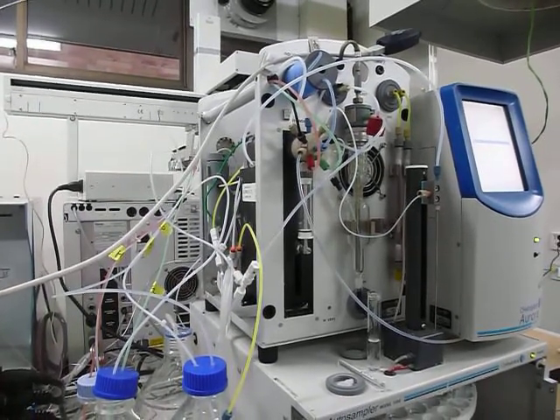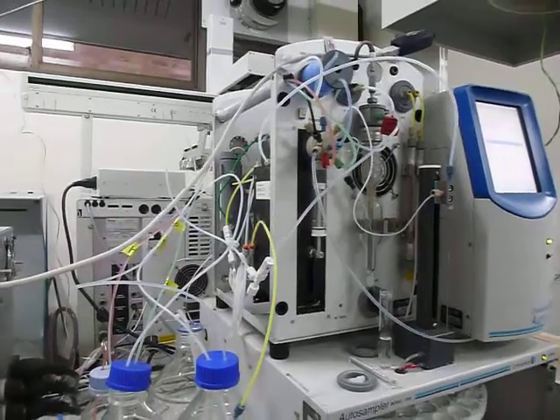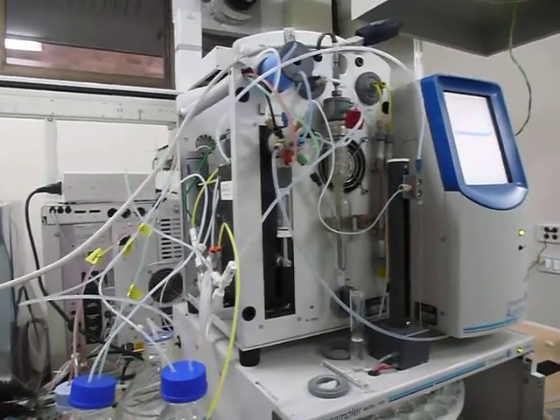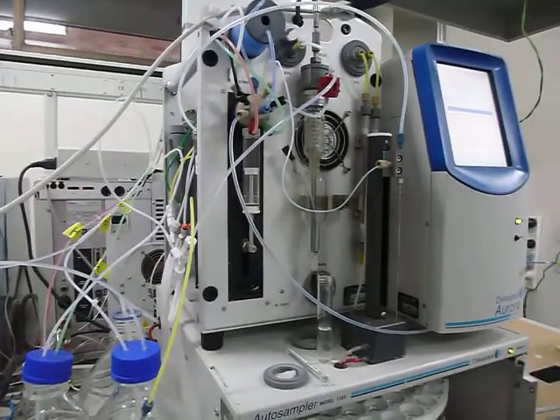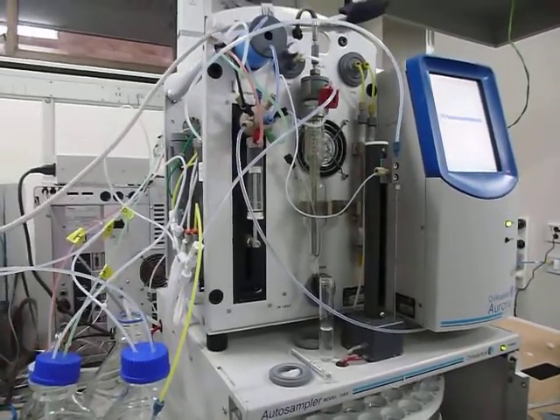It takes some water again, cleaning the lines and everything.